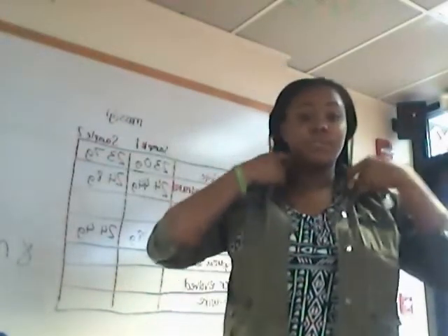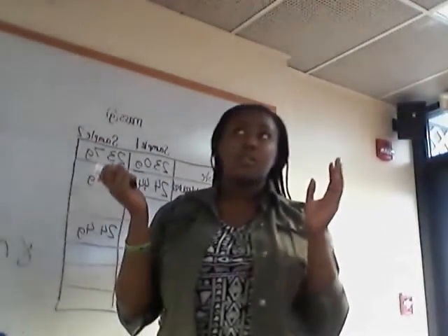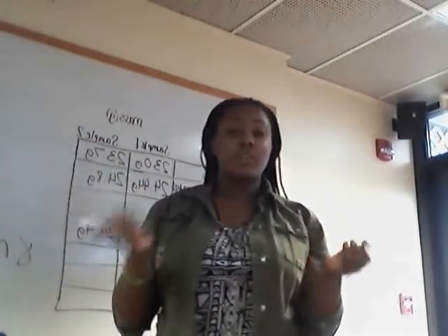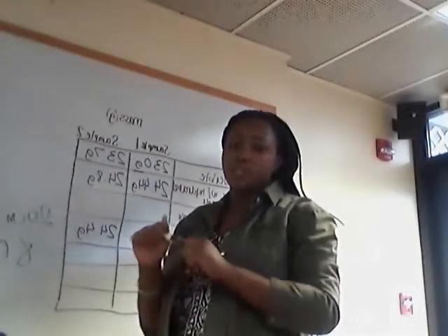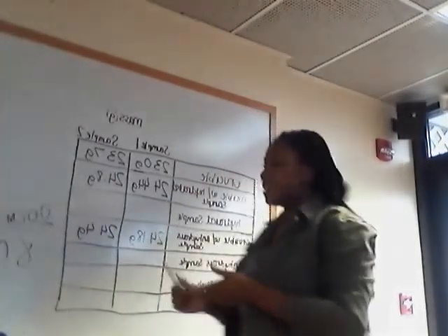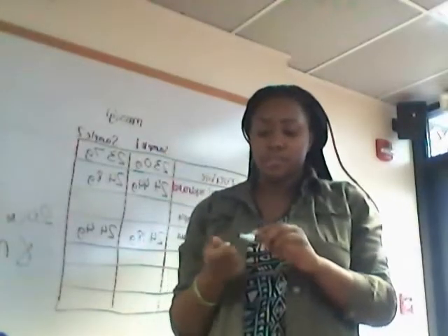Okay, aluminium. Then when that has been turned into the beaker, you get a little amount of aluminium. Our chemistry class had 20 centimeters, but we didn't use that, so we just used any amount. And I'm sorry that it's upside down. I think it'll flip back.